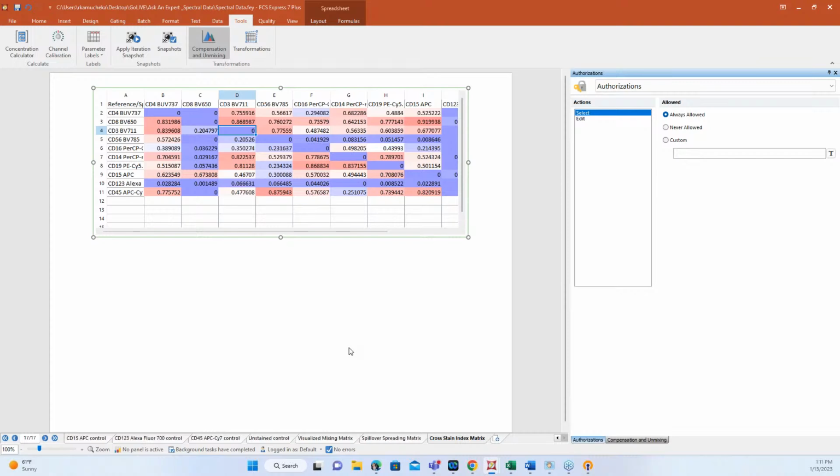When you bring your unmixing and apply it to your sample, if it looks good, you can trust that. If you see unmixing errors, then of course you can always revisit this, make adjustments, and update things, so you have that level of control. That's another reason why I like having them in two spaces. I can be working on my analysis, import that matrix, and if I see something a little weird, I can slow down and parse through that.